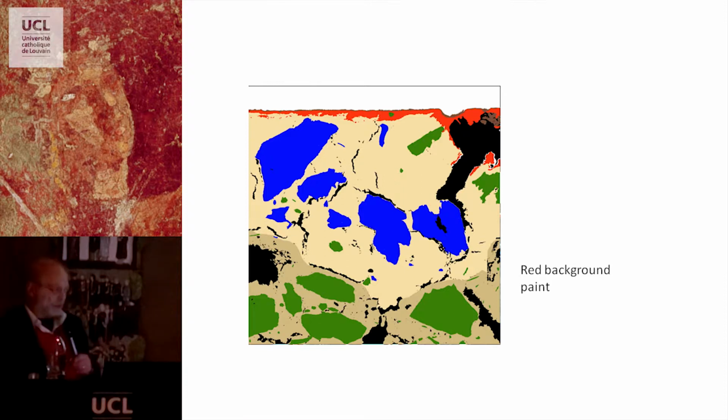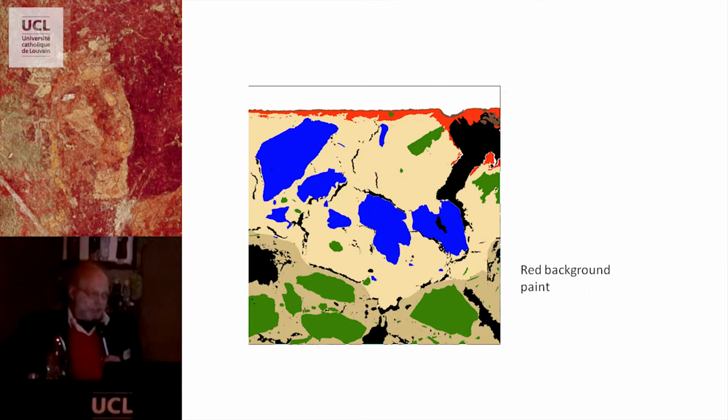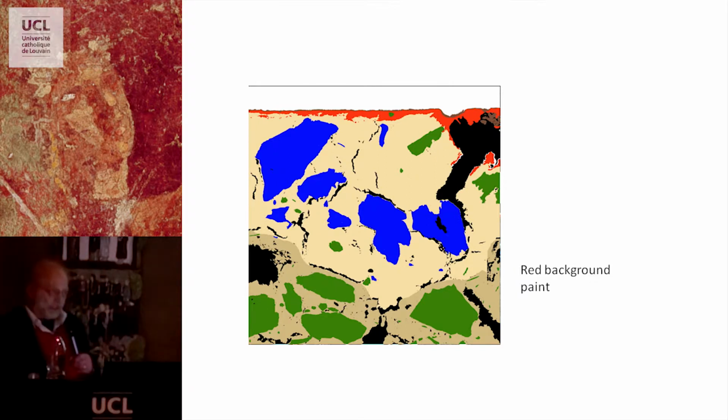Typical for most Roman paints I have studied so far, at least for the background paint layers, is that they have prepared a pasty color which has been applied on the surface. The only binder we can find now is lime-based, but it's not a fresco technique. Even if the support was quite fresh still, it's too pasty to be a fresco.